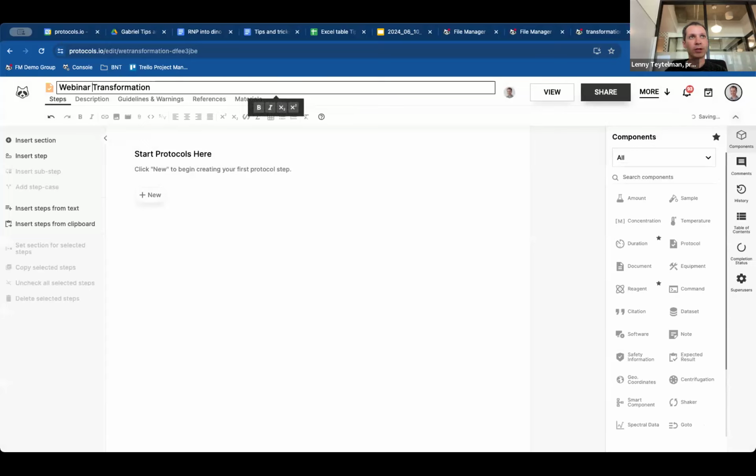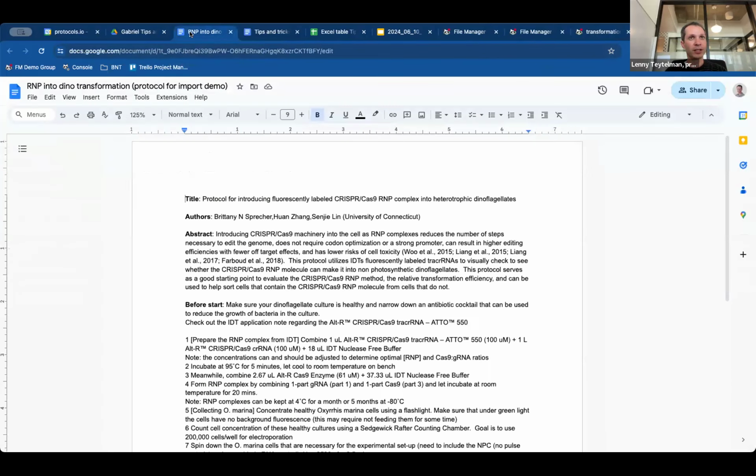We'll call it webinar test transformation protocol. The next thing I want to show, again going along with the existing protocol theme, is that imagine you have Microsoft Word. In this case, it's a Google Doc that we're working with.